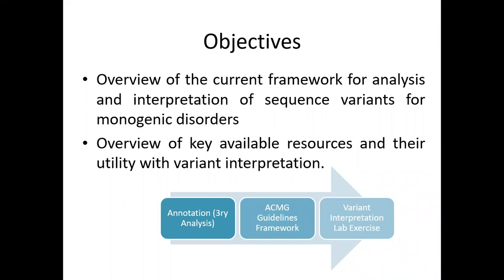The overview of the key available resources and their utility with variant interpretation. So in this workshop, we will be looking at different databases. We will be learning all those databases and how to use those databases for variant interpretation. So this is the workflow for the variant interpretation annotation. Then we have to look at those variants as per the ACMG guidelines. So we will be looking at what those guidelines are, and then variant interpretation.